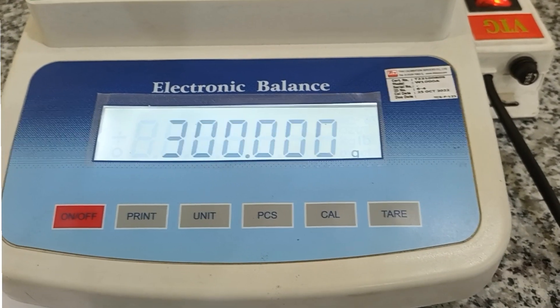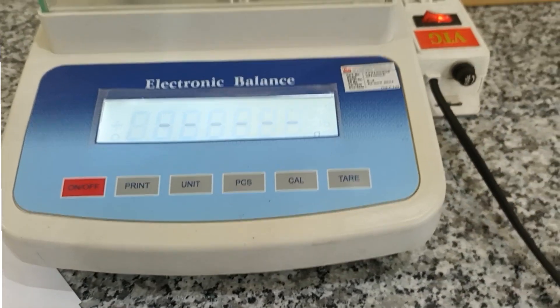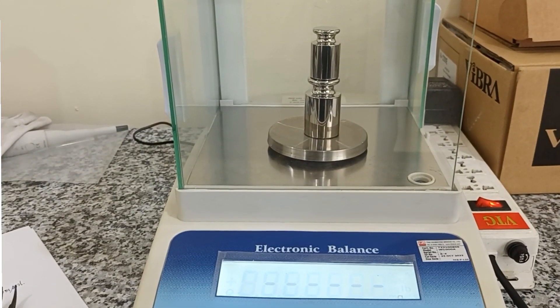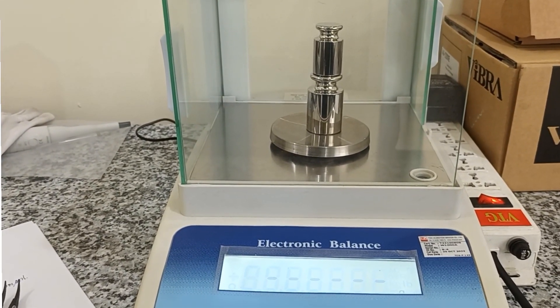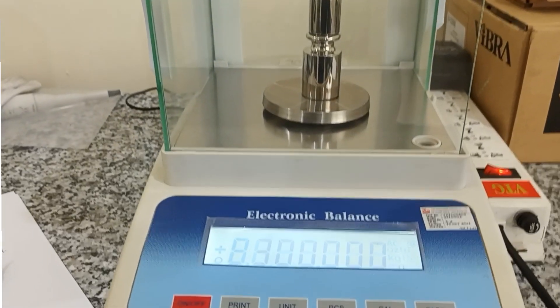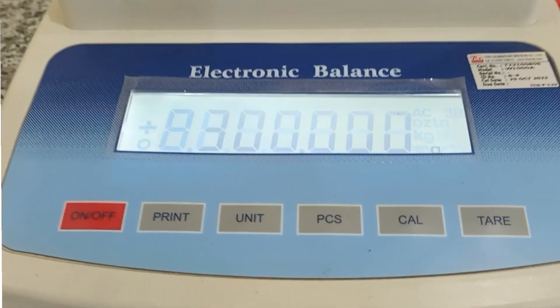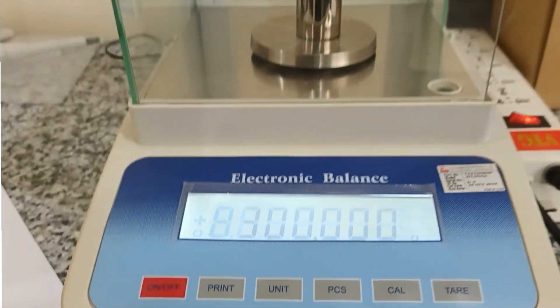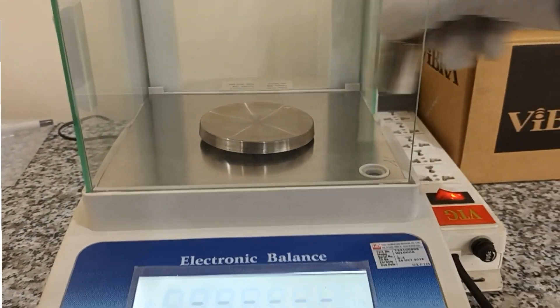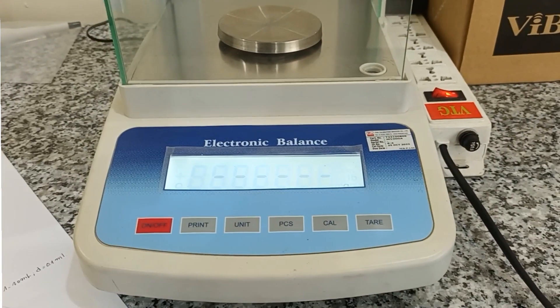It will show 300 grams. I will put the standard 300 grams weight and wait a moment. Yes, it shows 300 grams. After that, I will move the standard weight off the pan and wait.